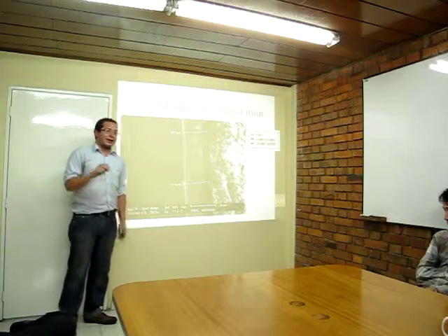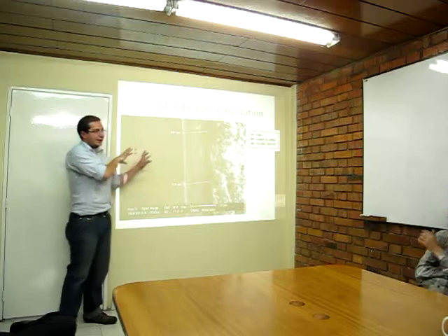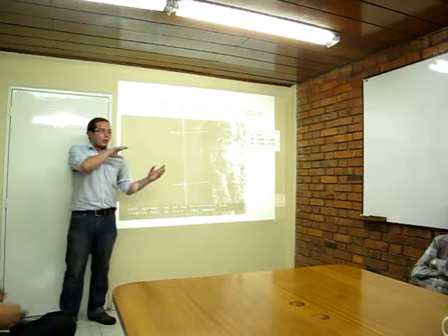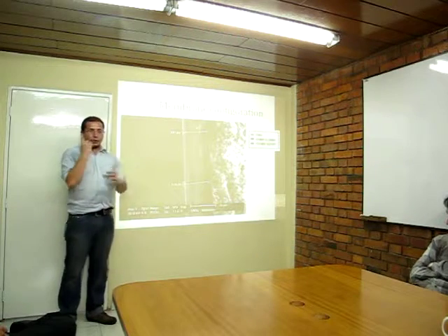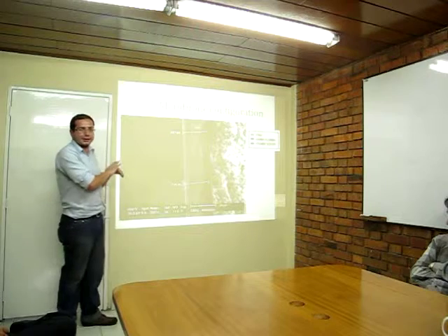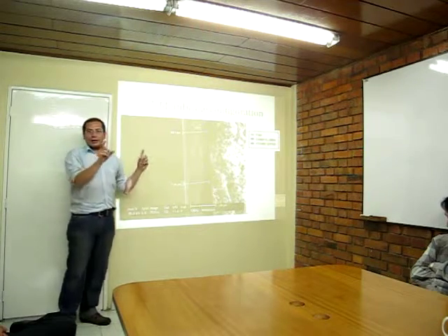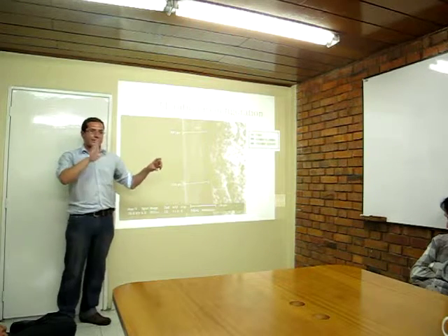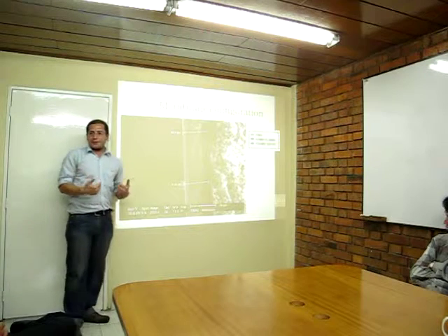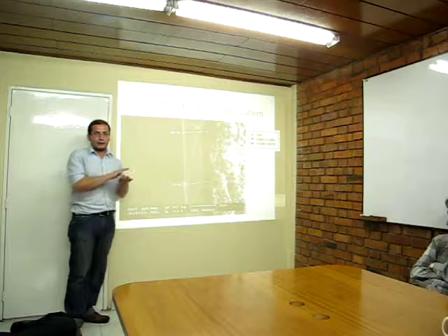Well, we test because we take this membrane and we take 2 pictures. One picture in this form, and we cannot see the membrane, and we move the membrane and we take another picture. The SEM has the ability to give you the composition of the layer.